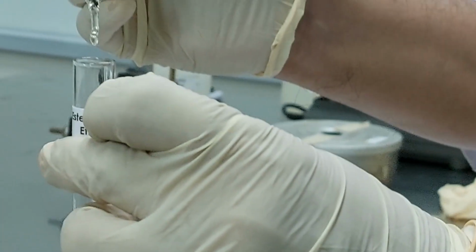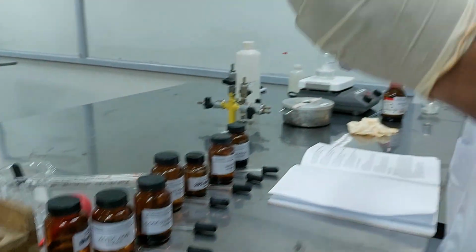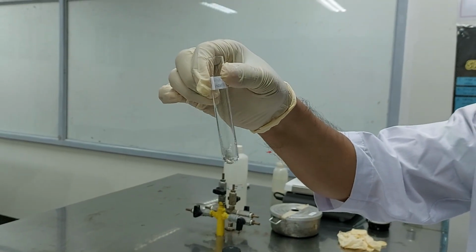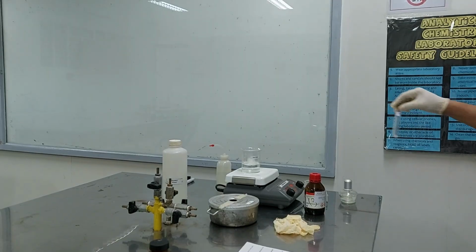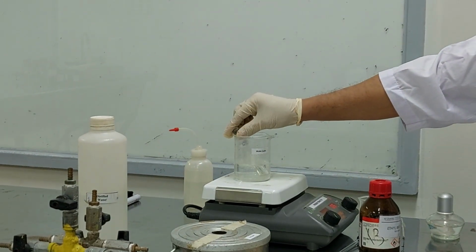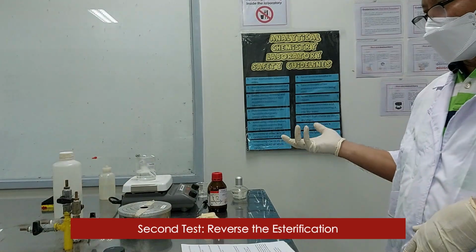You have to be very careful with acid, especially sulfuric acid. We're going to place this in a water bath to enhance the reaction, and then cover this with a marble to prevent evaporation of your reactants. So there, that is the esterification.